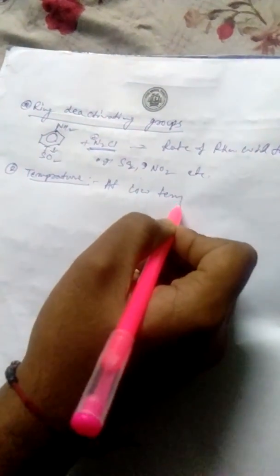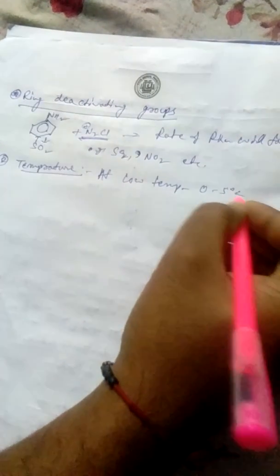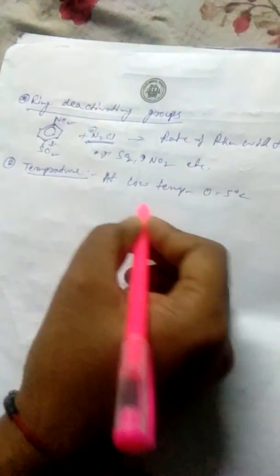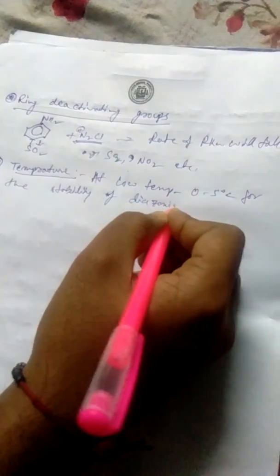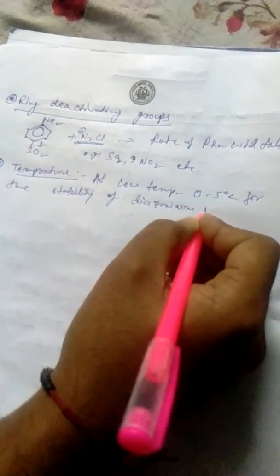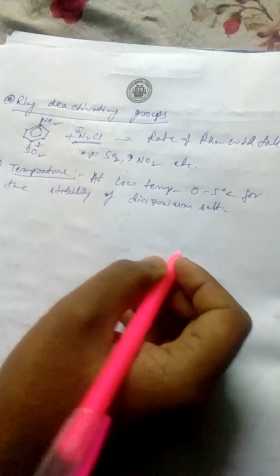At low temperature, 0 to 5 degrees is the proper temperature, low temperature for the stability of diazonium salts. Okay.